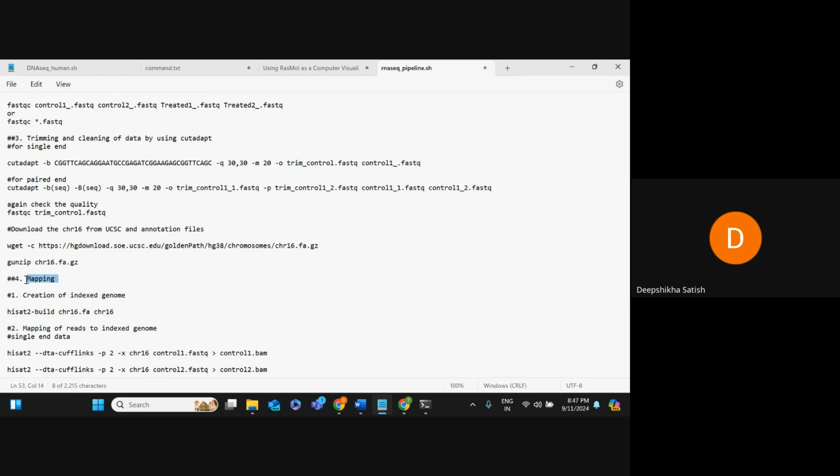So you can see this genome file is given in the FASTA format, right? Means it is in the human readable format. For the mapping, we are going to use the HISAT tool, right? The computer won't understand that format, because that is in the human readable format. That is why we are going to convert this, we are going to index that. So this is the first reason.